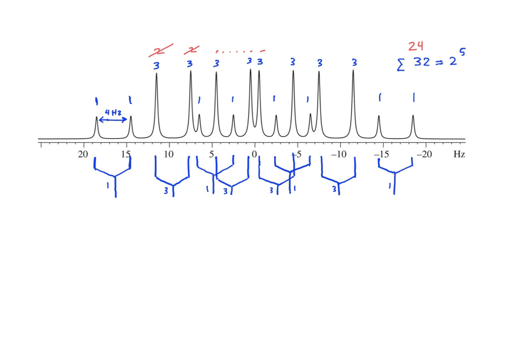We now find the next pattern. In this case, we see 1 to 3 as our first connection. And so we should look for another 3 and 1 to connect things. That looks like a quartet. And then we can find another quartet, 1 to 3 to 3 to 1.